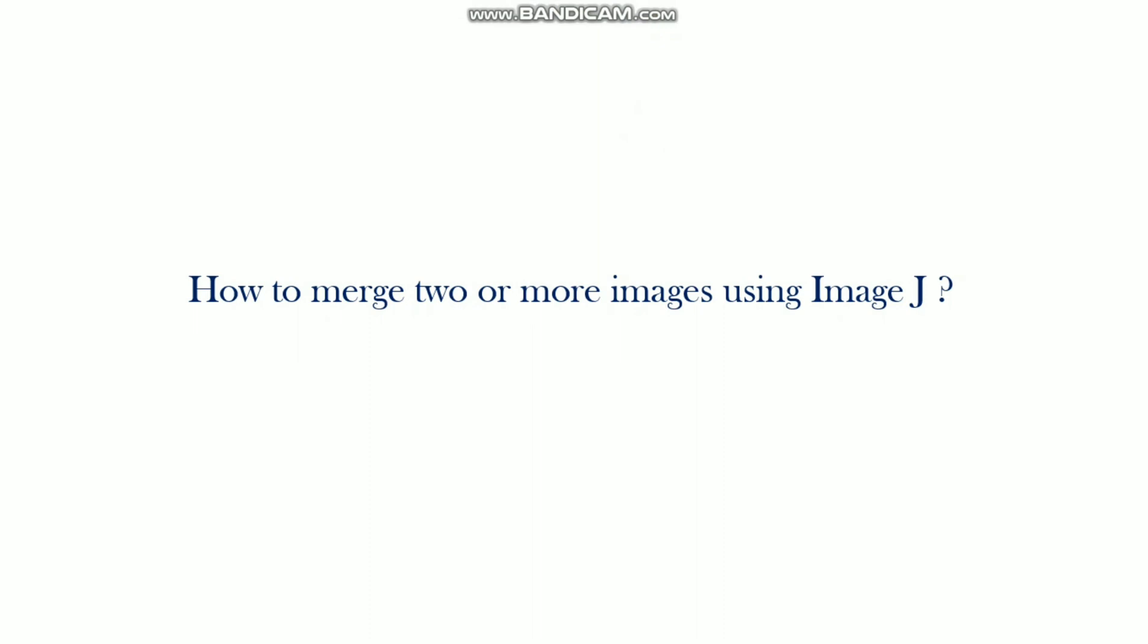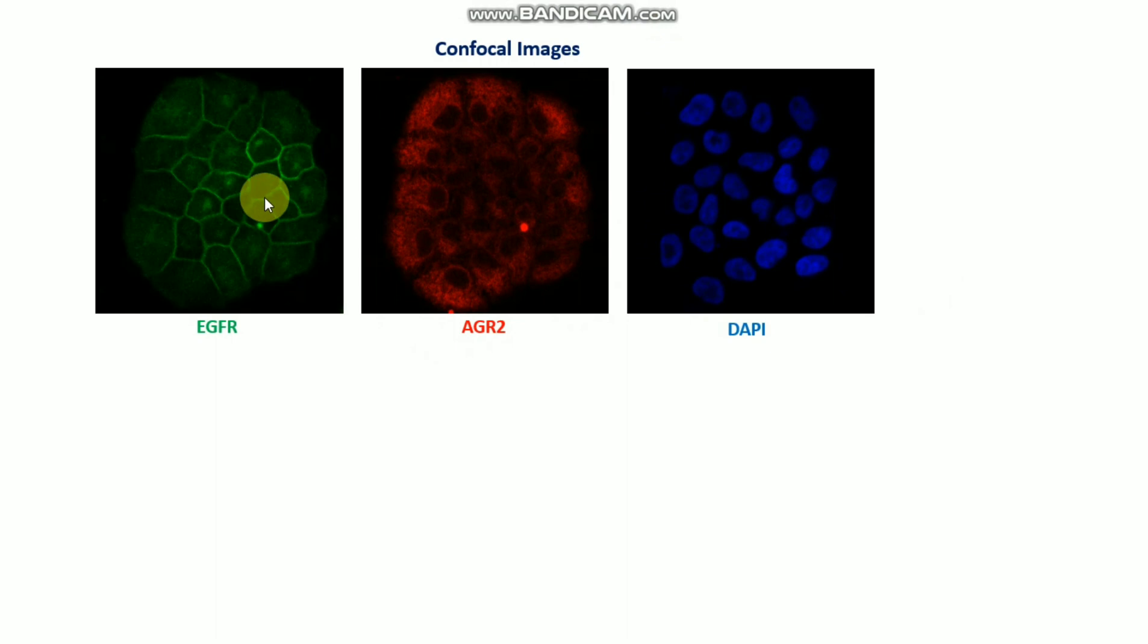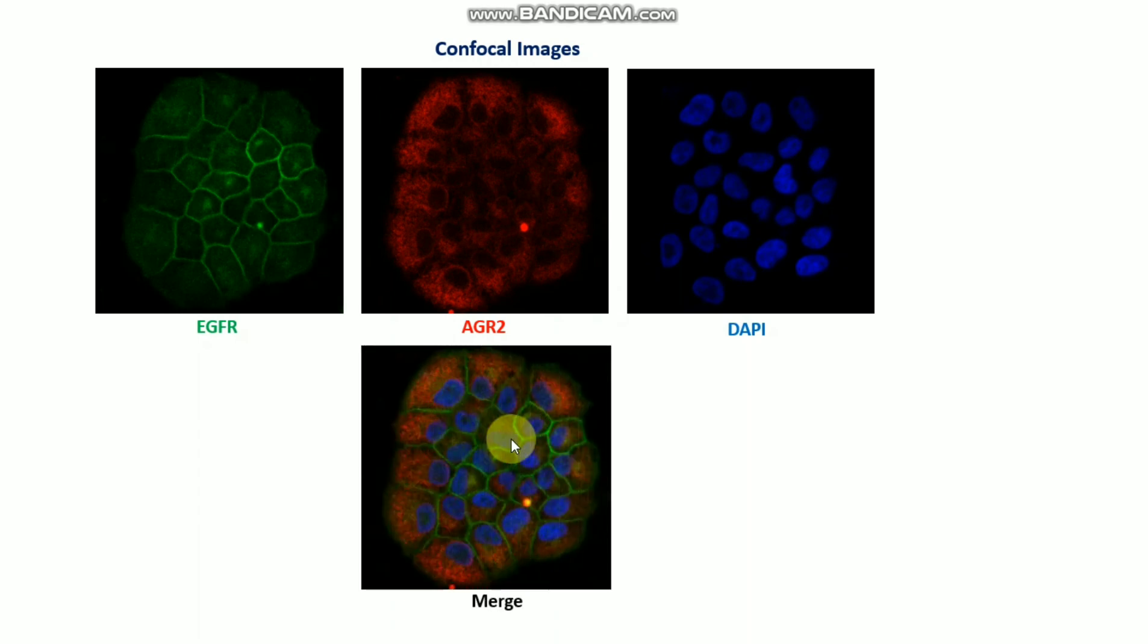For example, if you have confocal images like green color, red, and blue color DAPI, then you need to merge these images. So let's see how to do this by using the ImageJ software.